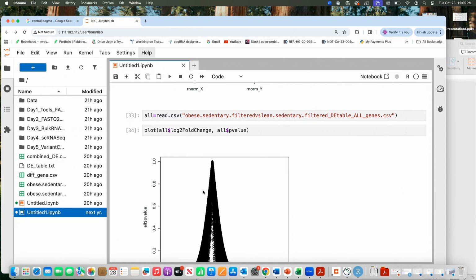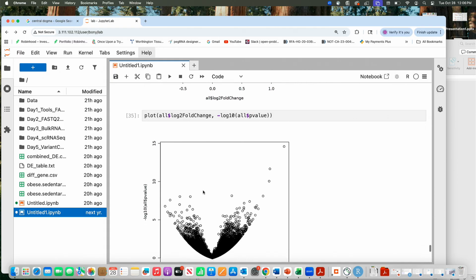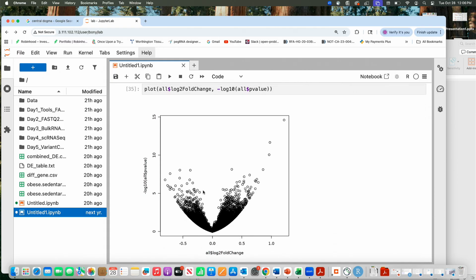Okay. Everybody could get it? So why is it called a volcano plot? You have seen how the lava comes out of a volcano. Is that not looking like that? It looks like a volcano is erupting and all these things are going up. Everybody got your volcano plot? What about people there in the back? You got it?